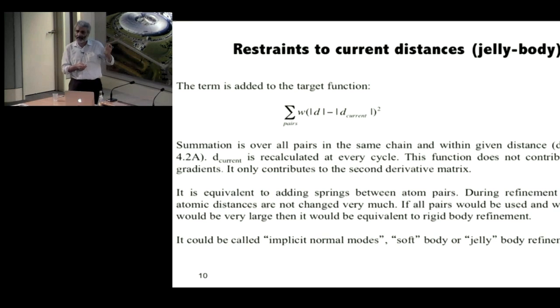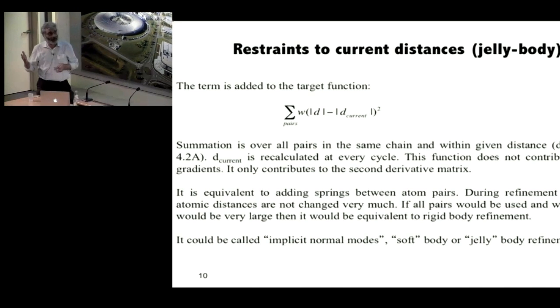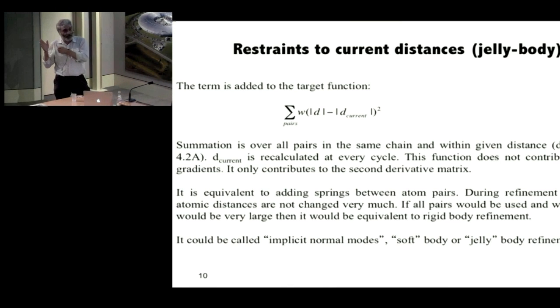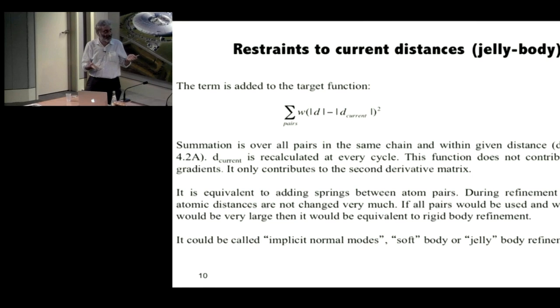Limited amount of data means that many different models can describe exactly the same data, but not all models are real, and some of the models may be complete nonsense. And to select among many models the one that describes our data as well as possible, we use this extra information.